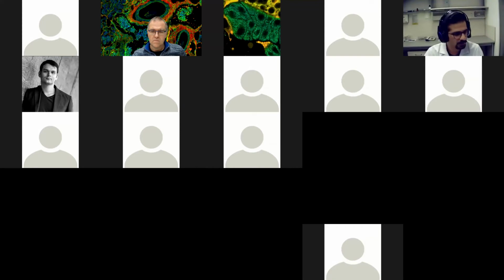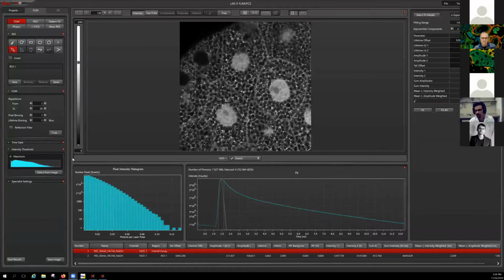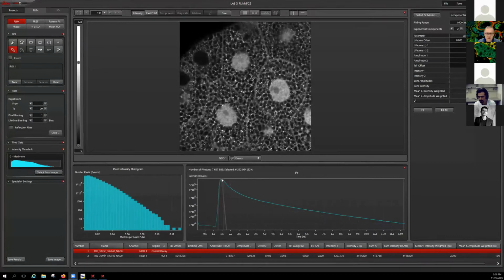So I'm just going to start my screen again here. Here we have the maximum count rate on our decay, and then it's dropping down to 1 over E of this value. So we say, for example, that a lifetime is 3 nanoseconds, and then the amplitude would be something like here in this case, for instance, like 100,000.